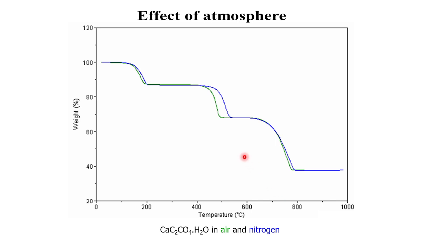Obviously after oxidation, the mass will change and we will get different data from the TGA at different atmospheres.